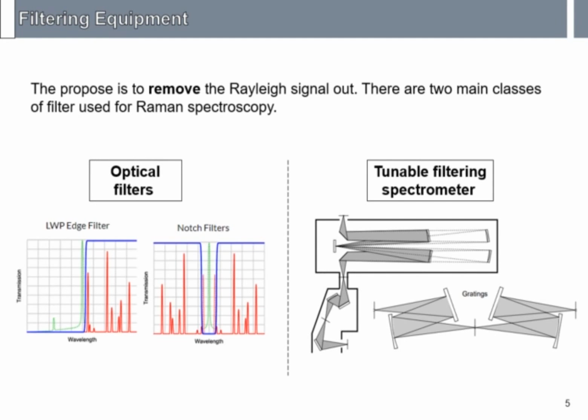So next we come to the filtering equipment, whose purpose is to remove the Rayleigh signal that we don't use for analysis.